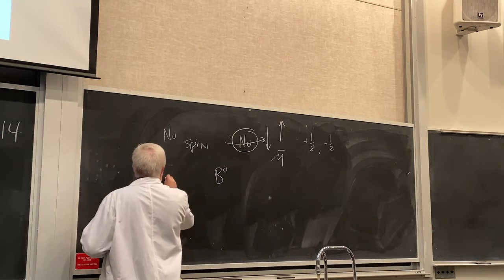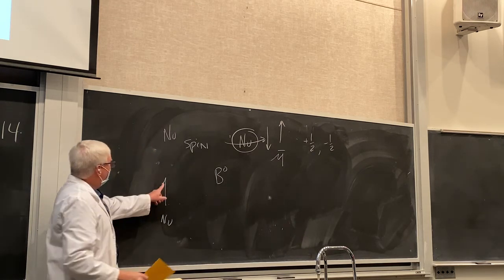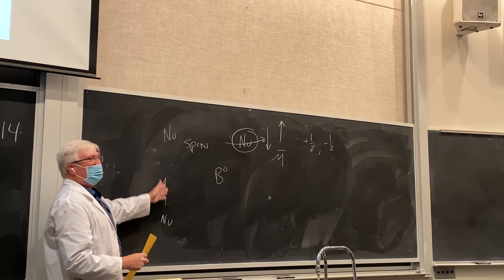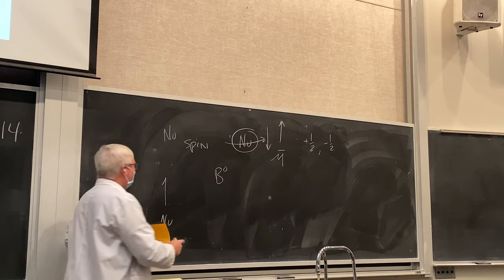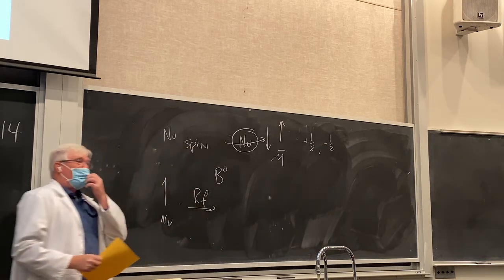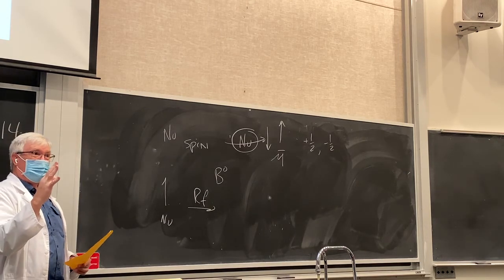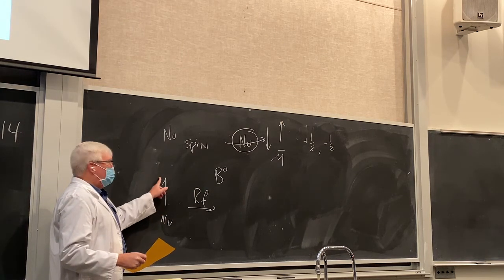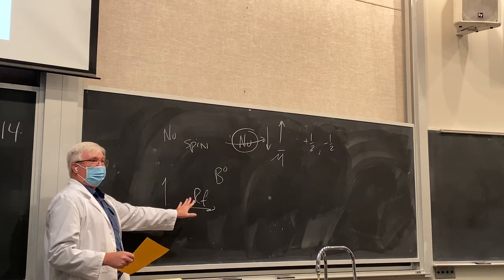Now, think of it this way. Here's the nuclei, and I have one object here, a single fishhook arrow. The arrow implies a magnitude of the spin. Let's say it's lined up with the magnetic field. Now we apply an RF pulse. This is a separate part of the spectrometer, a set of coils that are perpendicular to the sample in the tube. At equilibrium, we say the spins are aligned with or against the field. We haven't applied the pulse yet.